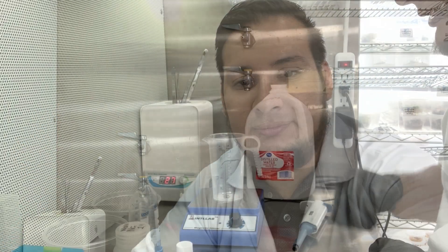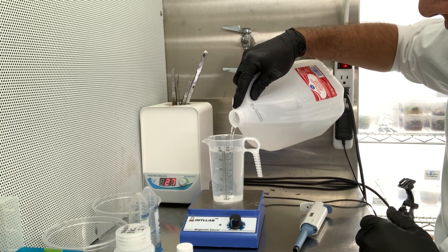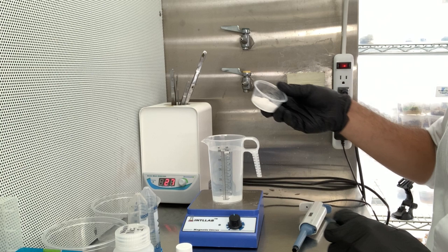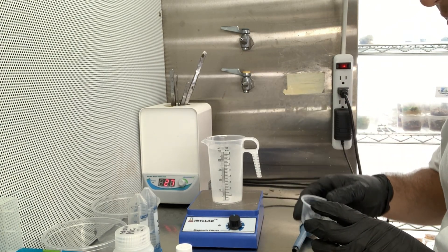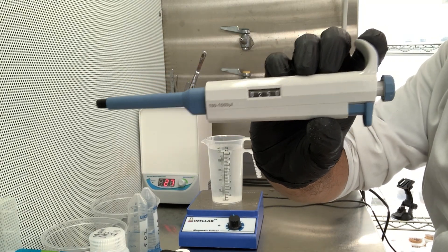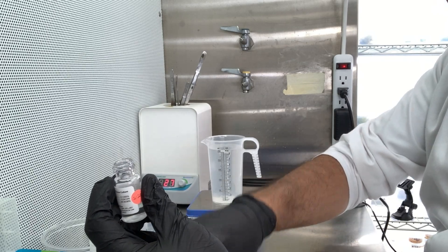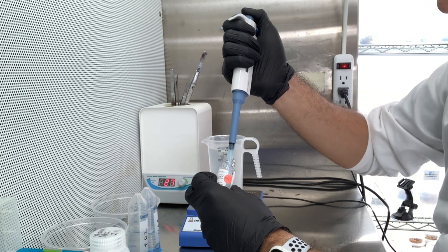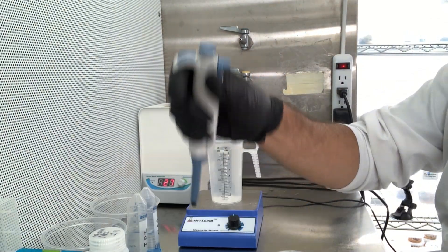I only want to make a quarter liter — 250 milliliters of water. Half MS media but full sugars and vitamins. I have my pipette set to 250, so each increment is equivalent to 1 mL per liter. Let's add PPM — I want to do 2 mL per liter because I have quite a lot of bacteria. Trash the tip and grab a new one.